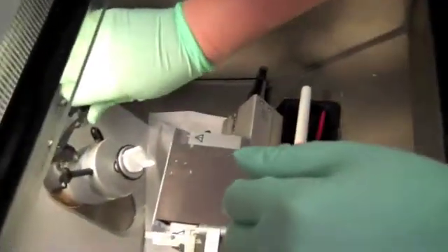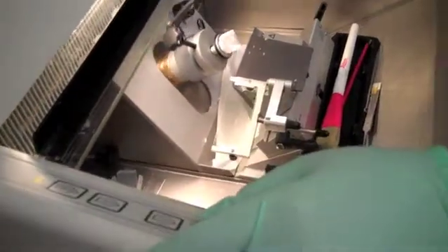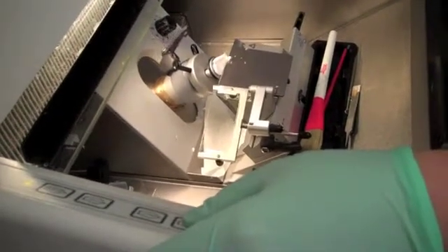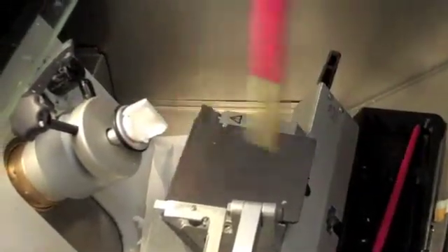Slide the chuck into the mount and tighten the knob above it to keep it in place. Set the dial next to the mount at 50 micrometers to trim your block. Use the side panel to move the mount closer to or farther from the blade. Turn the handle on the right side of the cryostat to move the mount forward. When you spot tissue, set the dial next to the mount to 20 micrometers to begin sectioning.